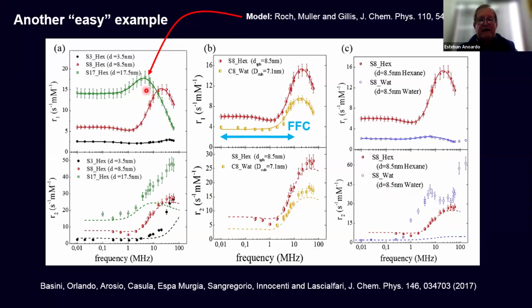So the authors here had to extend the range to higher frequencies in this case, to get the information they needed to get a good result. Okay, they did it with an electromagnet where they could change the magnetic field by changing the current, etc. So these two examples are very simple.